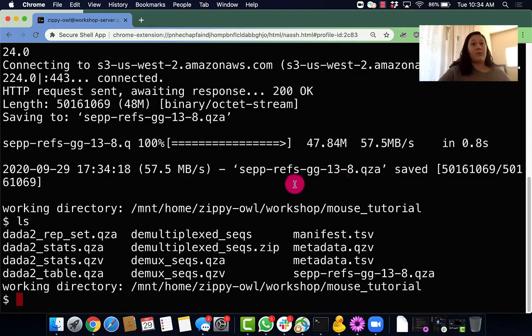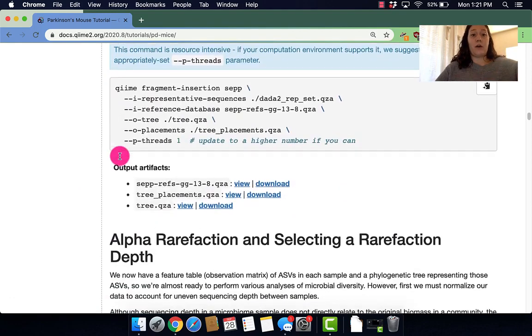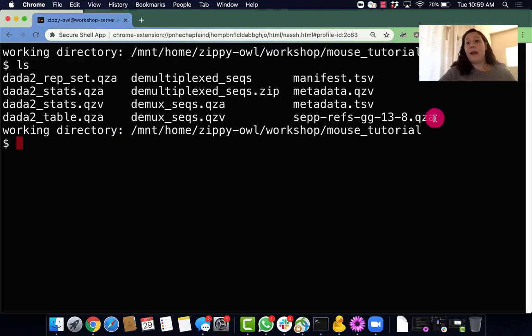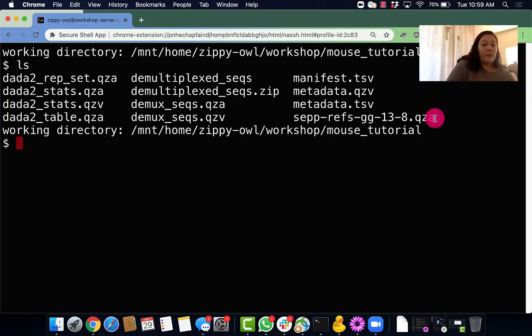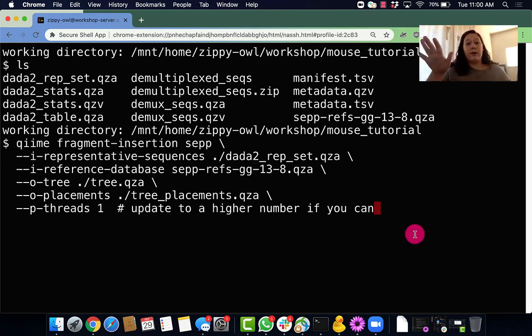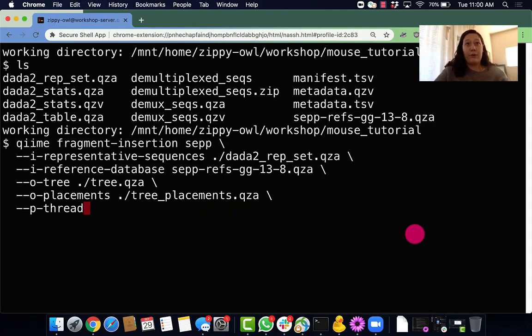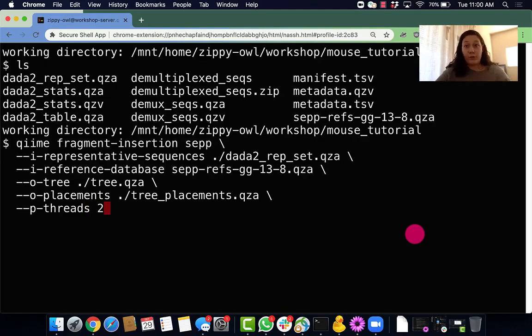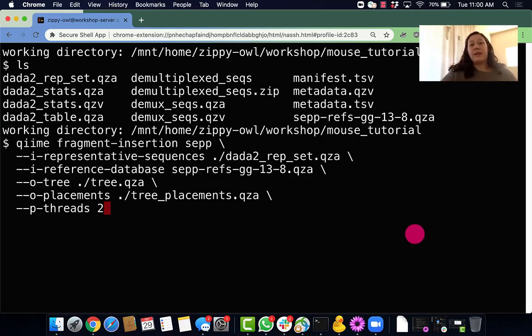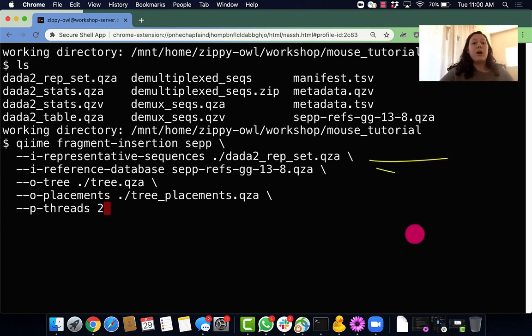Next we need to run the qiime fragment insertion set. I'm going to copy it from this little clipboard and scroll on over to my terminal. Now I'm going to paste it in there. So we need to talk about what we're doing. Before you run it we need to change this. I'm deleting this little comment that says to update to a higher number if you can. If you're on the workshop tutorial server you can upgrade this to two threads. If you're on your own server you need to select based on the resources available to you. So now that we have this, you can run this command and then I'll talk about what our parameters are.